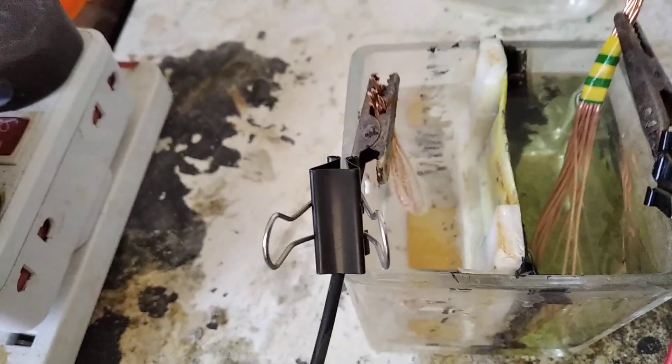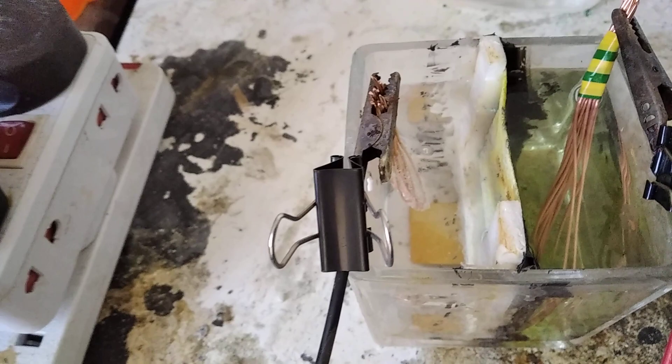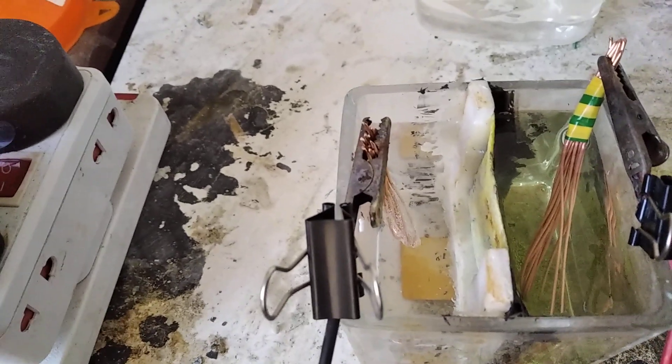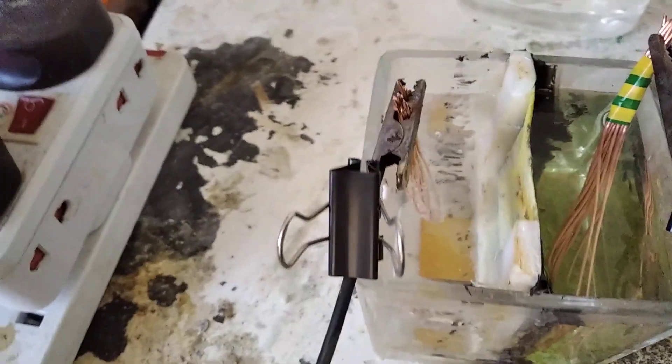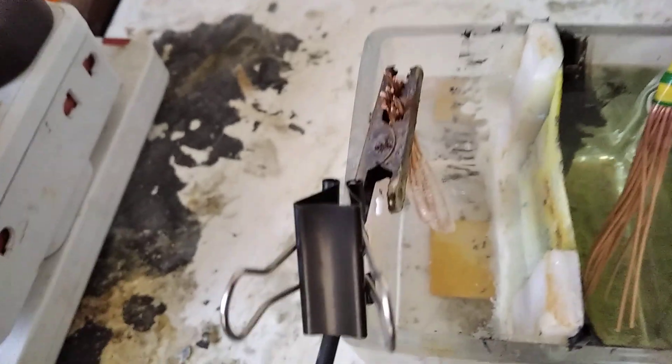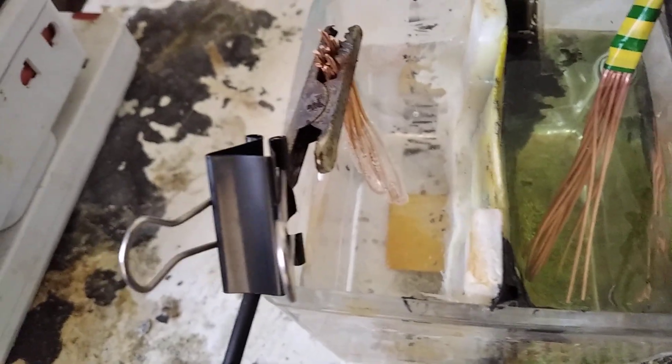The problem with using 34% acid in both cases is my nose kind of feels a little funny in this room. At the end of the day though, this should all get converted and hopefully, because it's acid, there will be no bubbling — just the release of copper chloride.